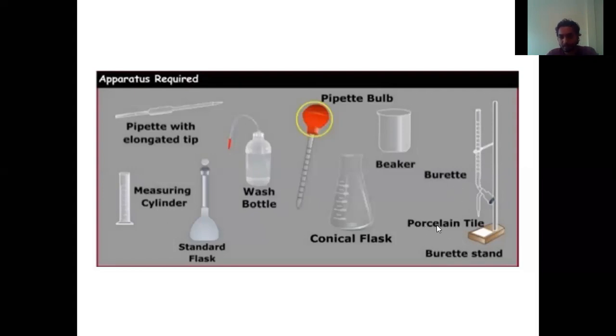Last one is the porcelain tile. Whenever we check the color of a chemical, we always use a white background against it. If you try to see the chemical color against a blue or dark background, you are not able to see the color properly. But if we see any color against this white color, whatever color we are looking for is clearly visible. That is why we mostly use this porcelain white tile. So these are the apparatus which we are going to use.